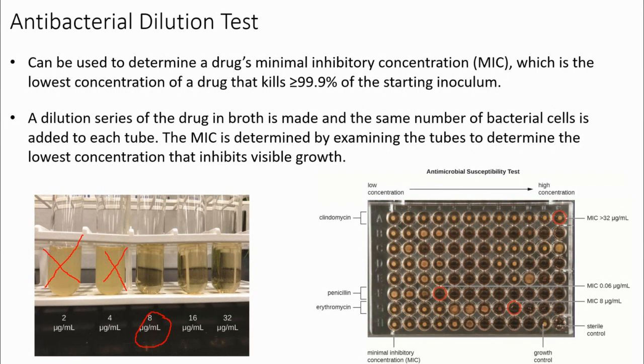And then when they take the plates out the next day, they can see where no growth occurred. And so you can see that with the little red circles with erythromycin, penicillin, and clindamycin. So they can figure out what that MIC is.